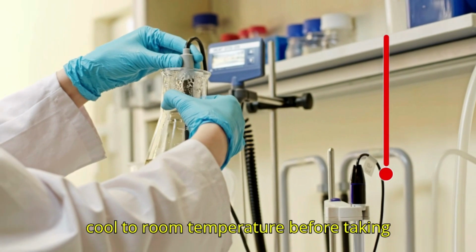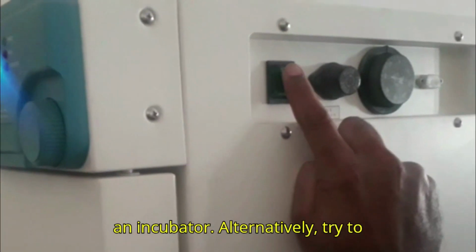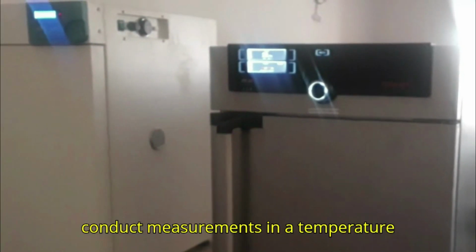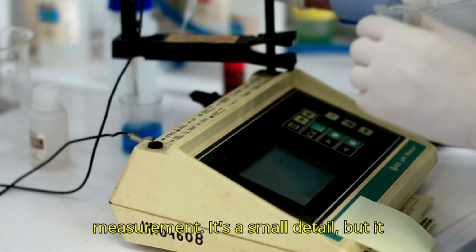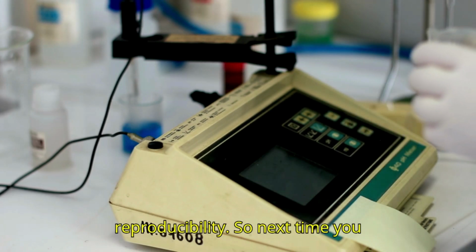First, let samples cool to room temperature before taking readings, especially if they've been in an incubator. Alternatively, try to conduct measurements in a temperature-controlled environment. Also, always record the temperature at the time of pH measurement. It's a small detail, but it could be critical for your experiment's reproducibility.